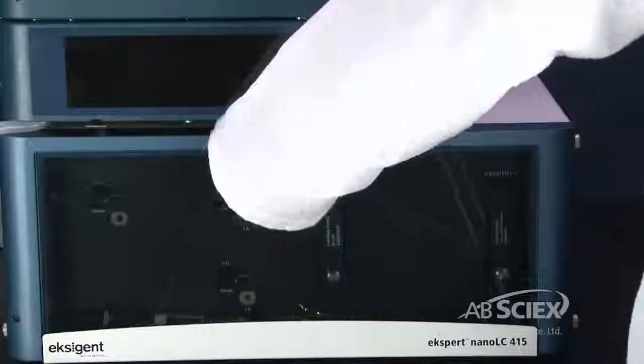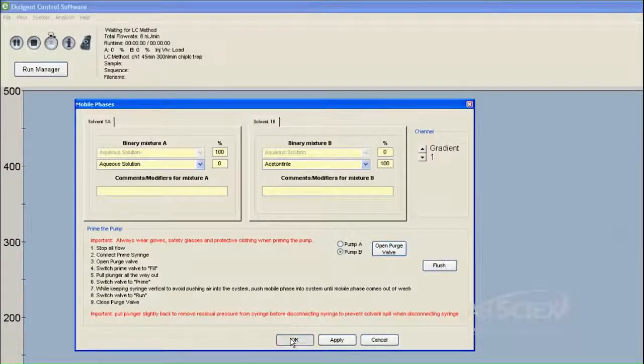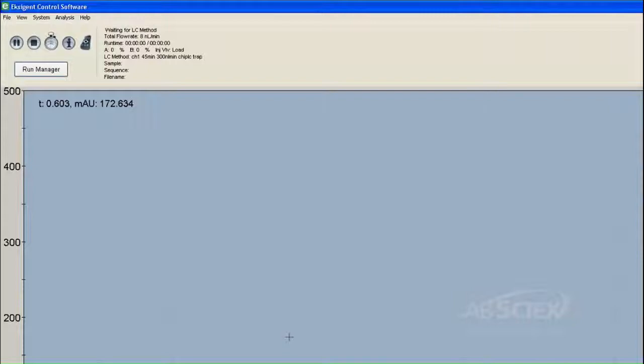Close the mobile phase cover. Click OK to close the mobile phase window. Repeat these steps for each pump line to be primed.